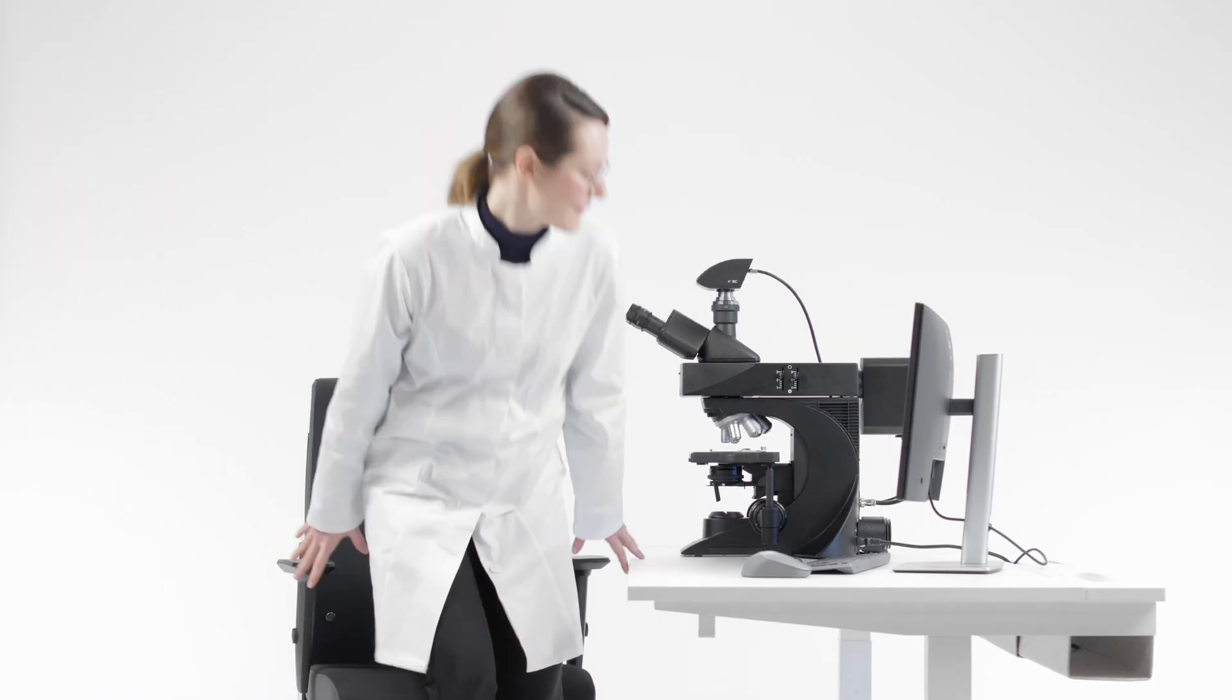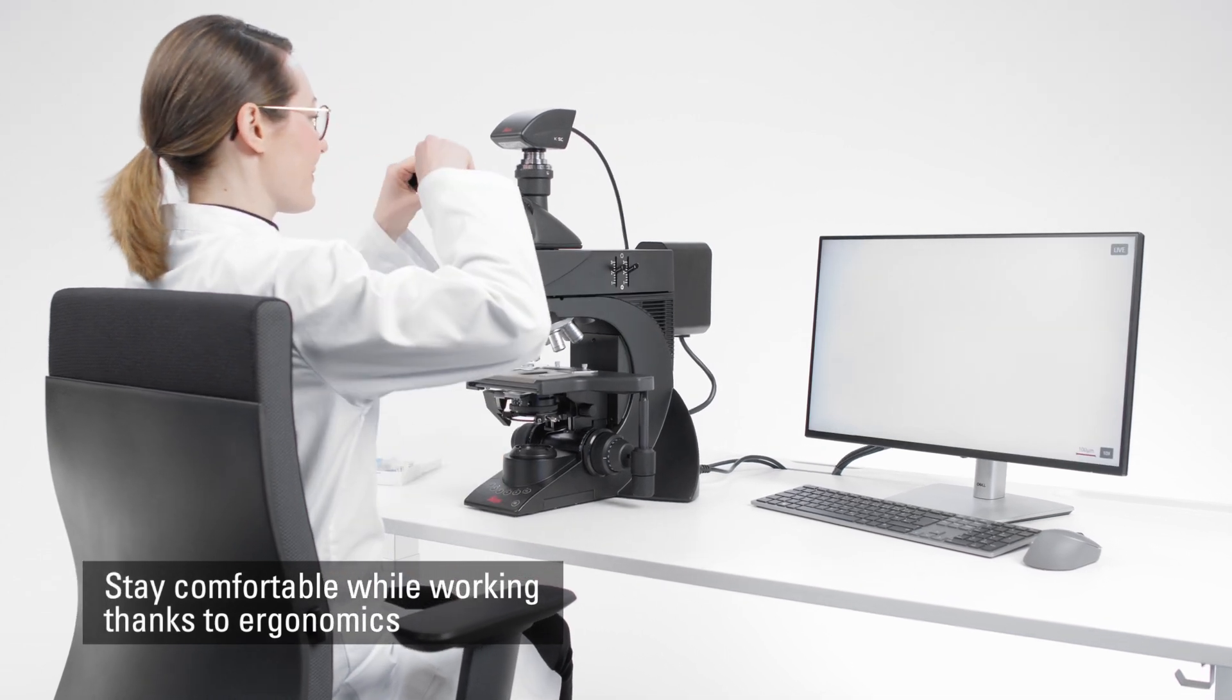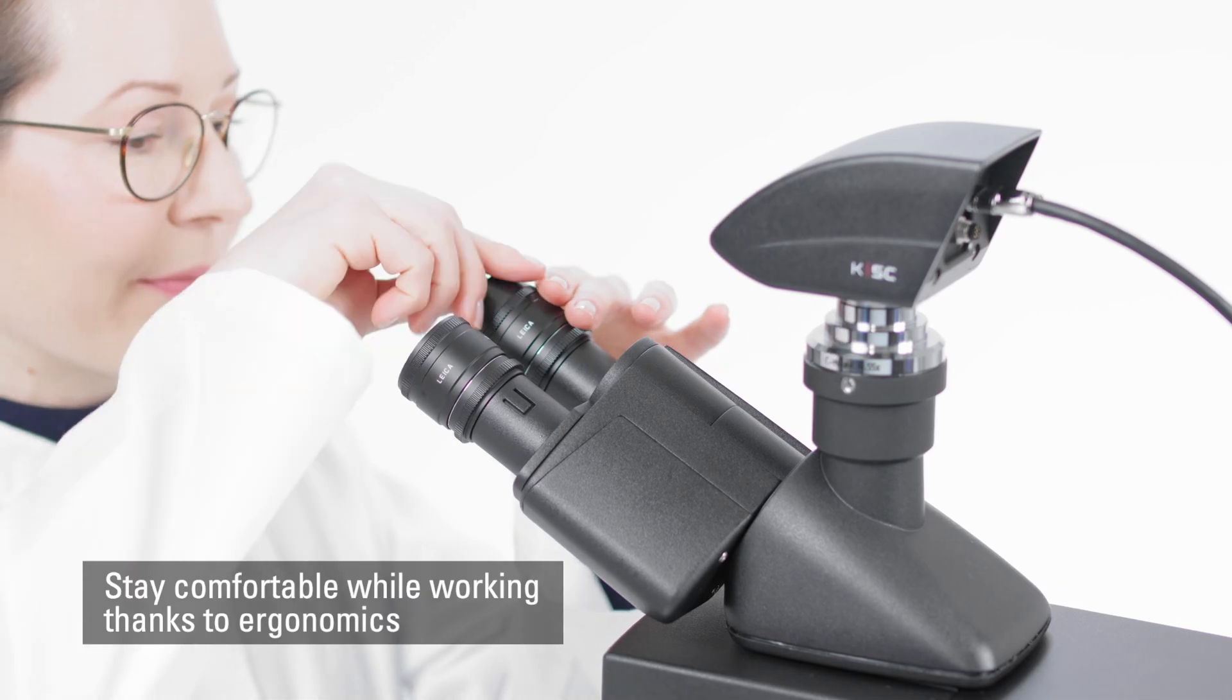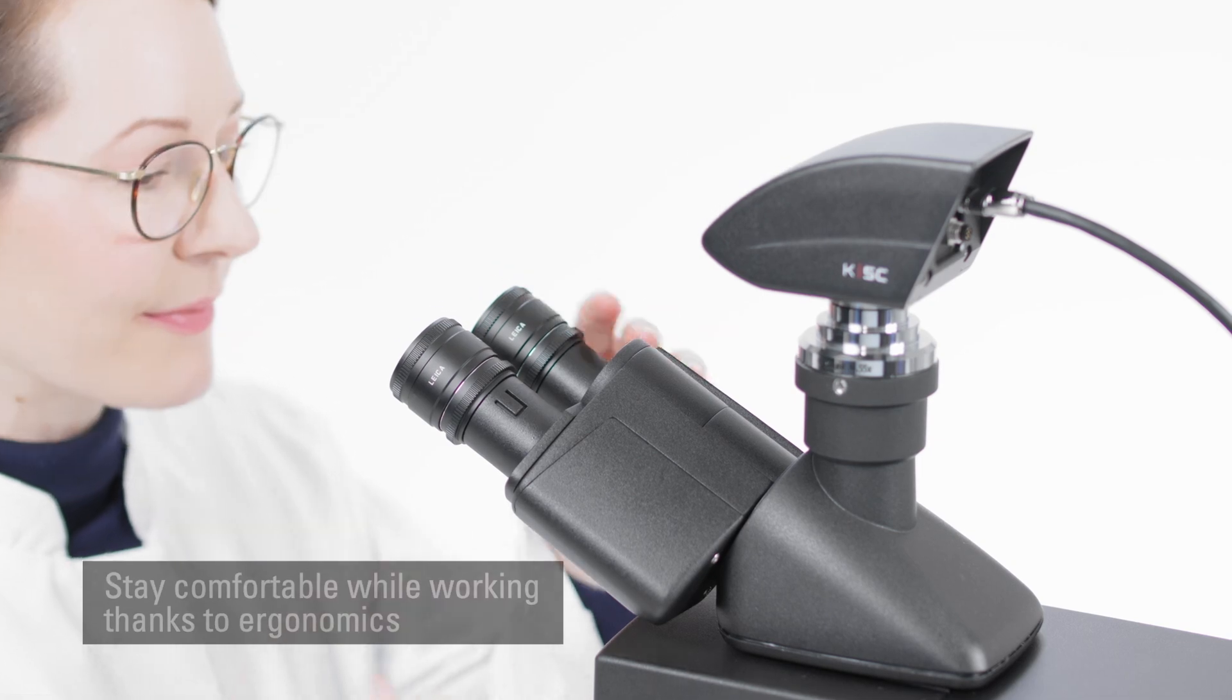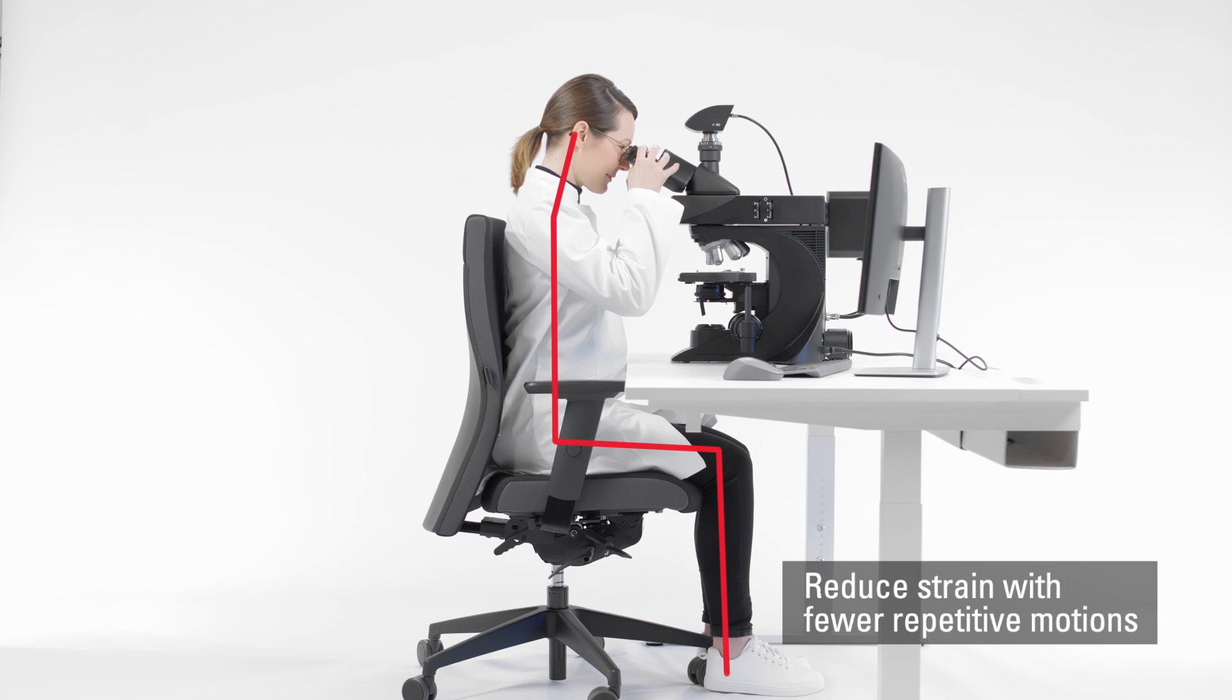Adapt the microscope to your needs with various ergonomic accessories when you spend long hours working with the microscope. Stay comfortable and reduce the risk of repetitive strain injury by maintaining proper posture from beginning to end.